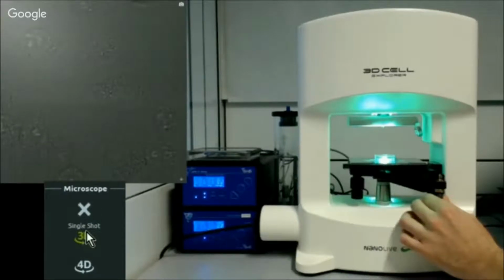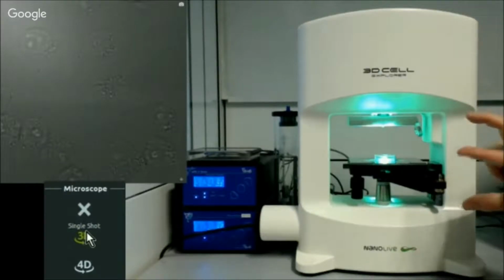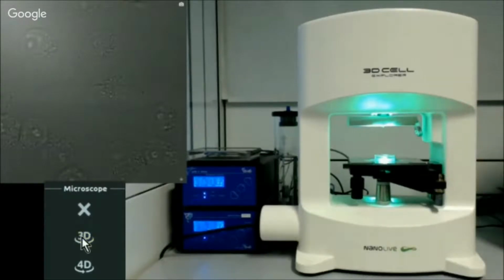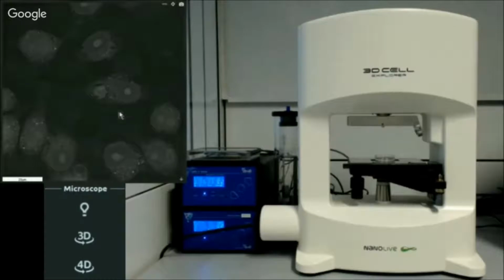Focusing does not need to be so precise, because anyway we are taking a Z stack, so the focus just needs to be somewhere in between. And okay, so ready, steady, go. Please wait a second. Look at the arm. You will see how fast it is. Okay, now it's spinning. You don't see the laser because it's just too low power. And off we go. So here we have our 3D Z stack of pictures based on refractive index.